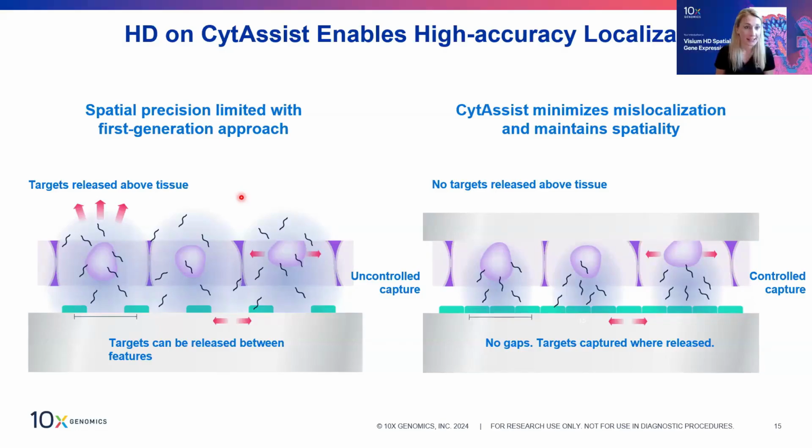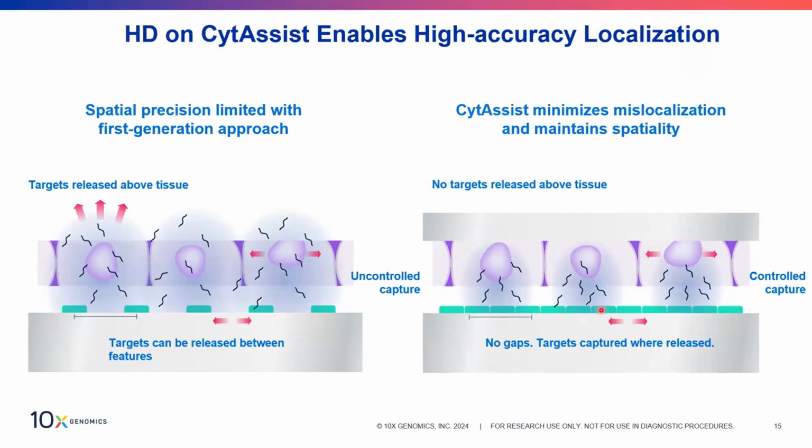Okay, about the thickness, there was an answer coming from Bart, one of our panelists: 3 to 10 micrometer thickness. 3 to 10, okay. I wasn't sure if it was 3 to 8, but 3 to 10, that's very good to know. Thank you. Okay, perfect.